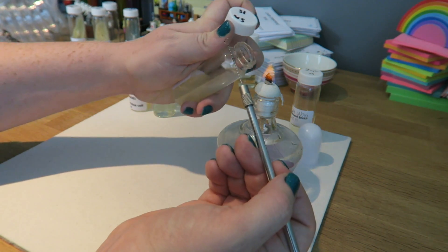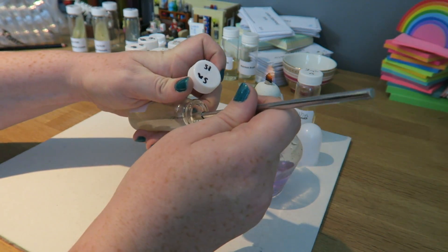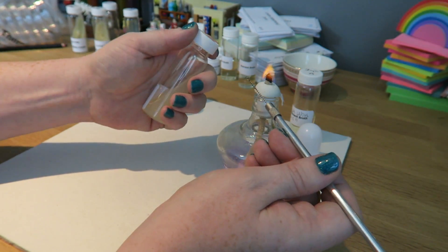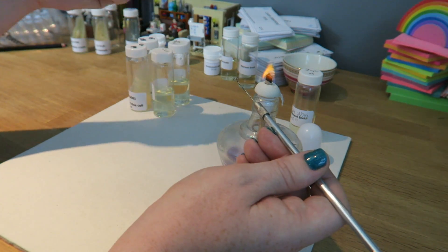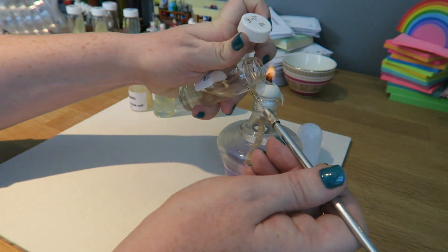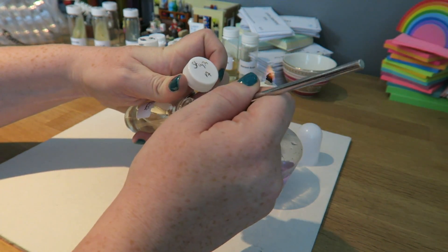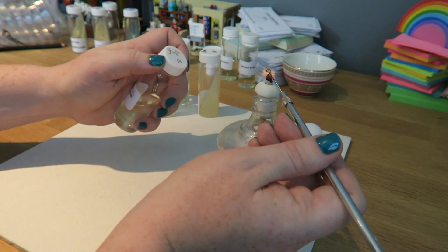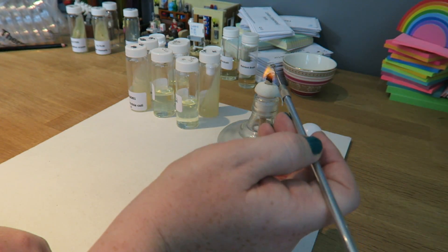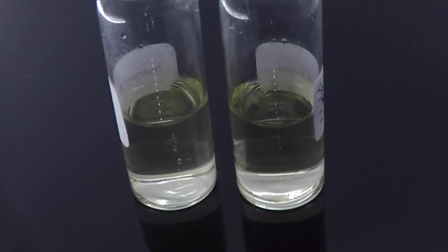Taking the lid off the culture, flaming it, picking it up, flaming it, lid back on, into my nutrient broth, lid off, flame the nutrient broth, inoculate it, flame it, and then finally cleaning the loop of any bacteria that's on there.